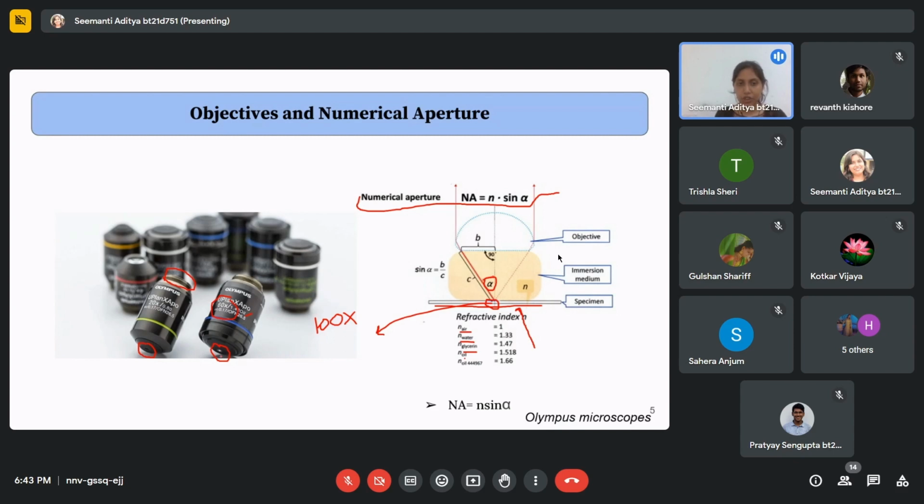On top of the lens we have to put one drop, a very small amount of oil, some 3 to 4 microliters, and then image it to get the proper resolution. Otherwise we are not going to see any kind of image, and then we will be wondering whether the problem is with the sample or not.